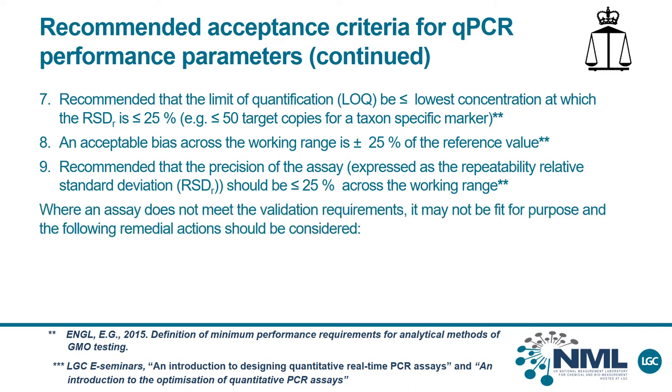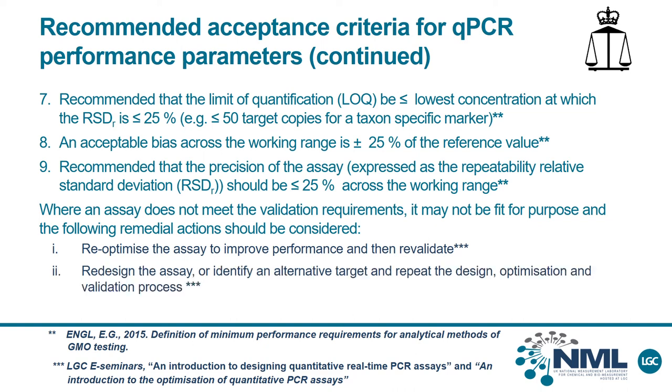Where an assay does not meet the validation requirements, it may not be fit for purpose, and the following remedial actions should be considered. Either attempt to re-optimize the assay in order to improve its performance and then repeat the validation process.